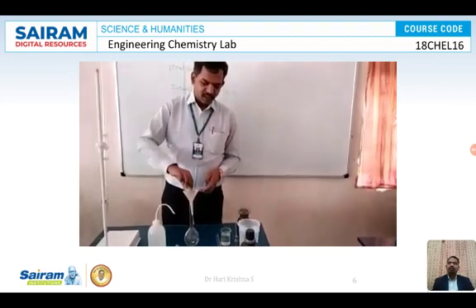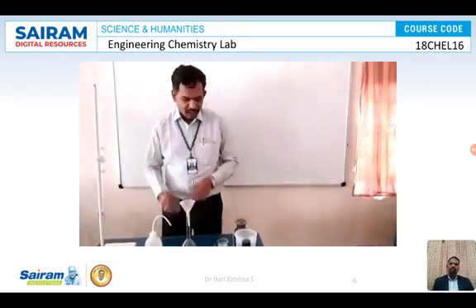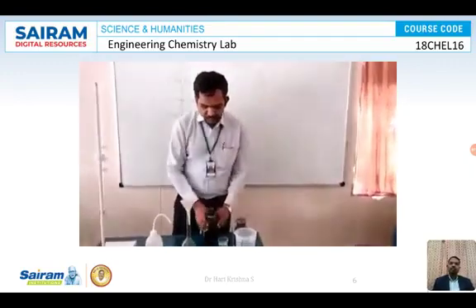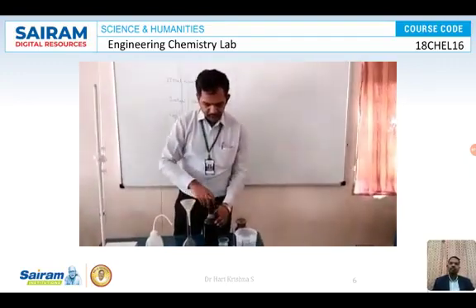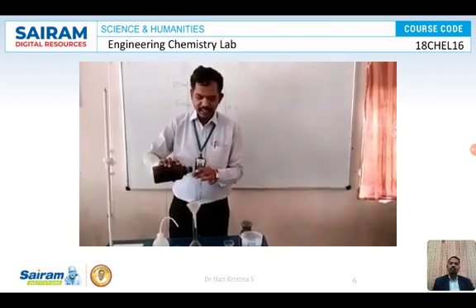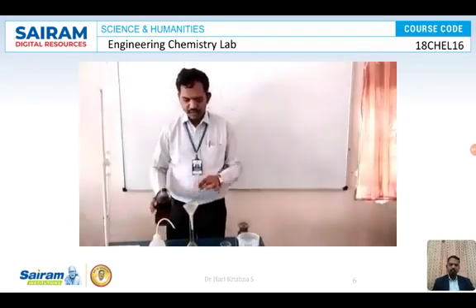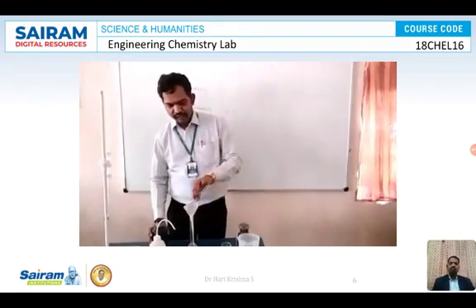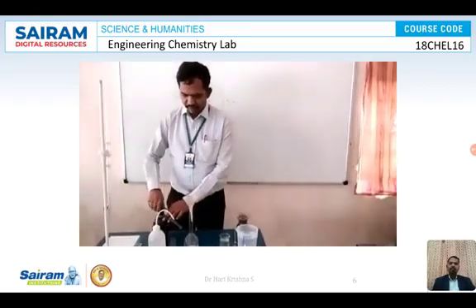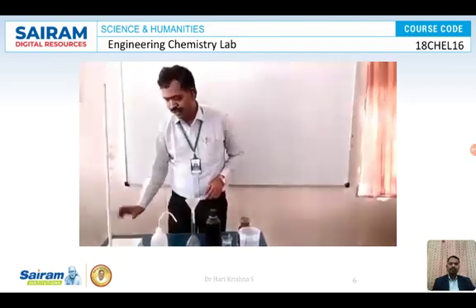We take a 250 ml standard flask, or volumetric flask, and add 1 test tube of ammonia. Ammonia is added in order to increase the dissolution of the EDTA taken. So we take the EDTA and add 1 test tube of ammonia. Then we add a little amount of water. Once you add Na2EDTA to this, it will be weighed again to know the amount of salt taken.